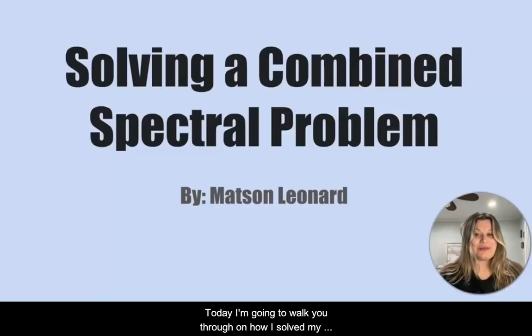Today, I'm going to walk you through how I solved my combined spectral problem and determined the structure of an unknown compound using its molecular formula, degree of unsaturation, IR spectrum, C13 NMR, and proton NMR.